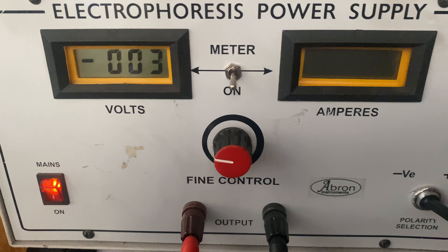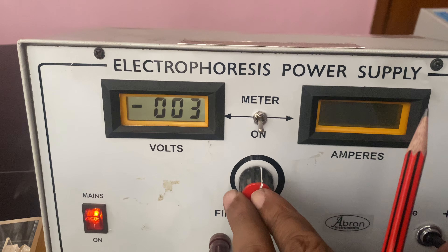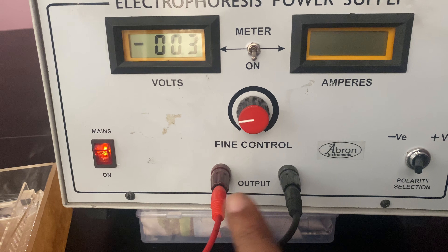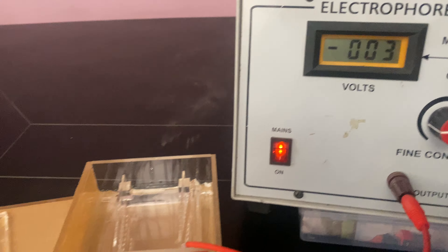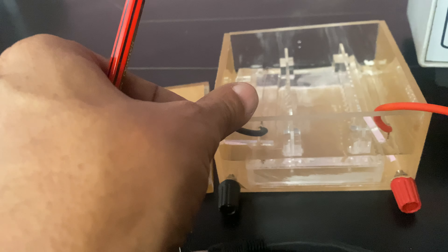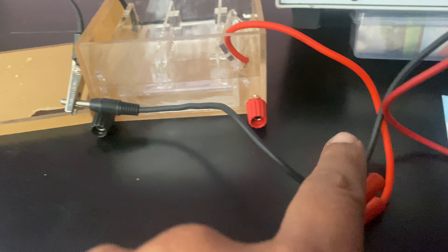This is the electrophoresis apparatus by Abron Exports, which has a power supply with a meter for ampere and voltage — both are selectable. You can go to higher volts and there is a negative and positive terminal. The output can be increased, and the volts can be changed. There are two platinum resistance wire electrodes which connect to the chamber.